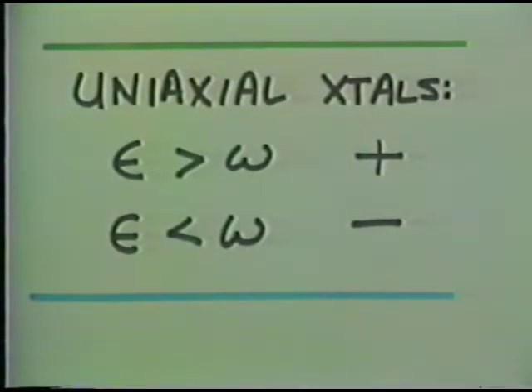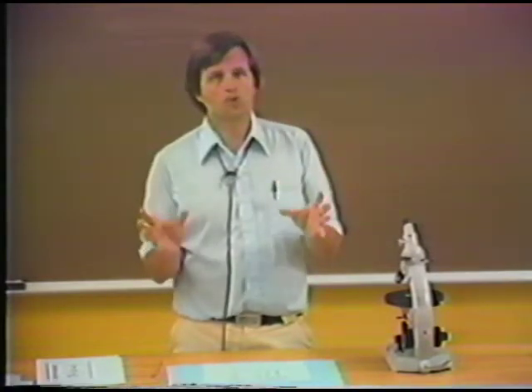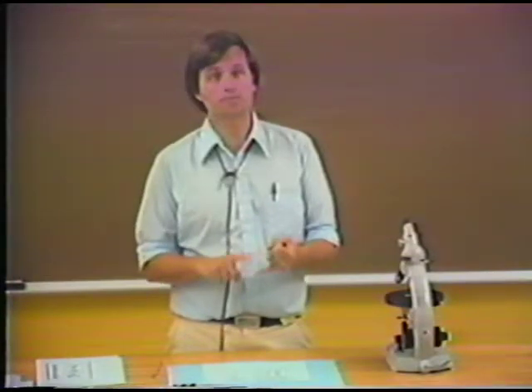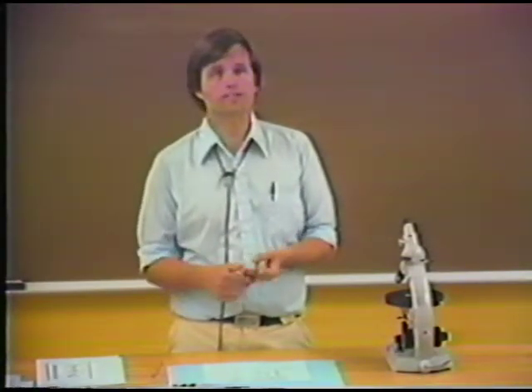And since we've gone now to the trouble of looking precisely at what the omega refractive index is, we've made its refractive index determination by orienting the figure properly and looking only at the O-ray and testing the relief using the central illumination test, the Becke line test that we have demonstrated before, or using the oblique illumination test.